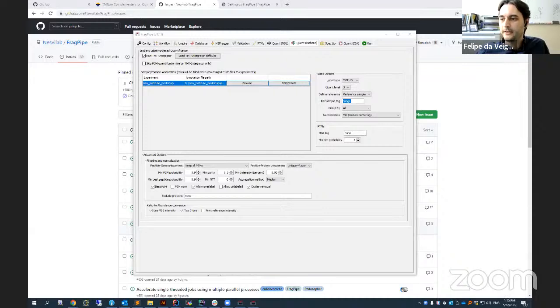Can I just use peptide level? Yes. Fengchao, can you click on the group by option there? You see, you can choose having a gene level, protein level, the peptide sequence, the PTMs, all. If you click on all, you're just going to see all tables being printed.